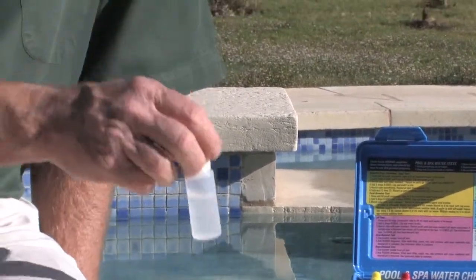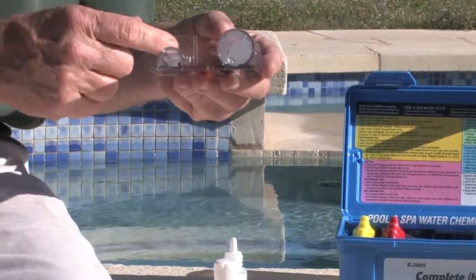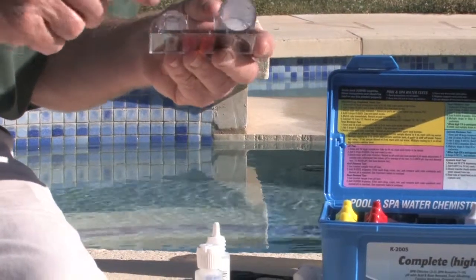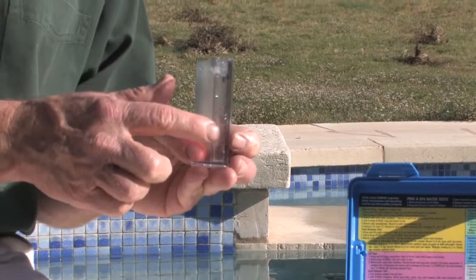This is a turbidity test. In the bottom of this vial there's a black dot. We will add the reagent until that black dot disappears, and then read the amount of cyanuric acid on the side of this vial.